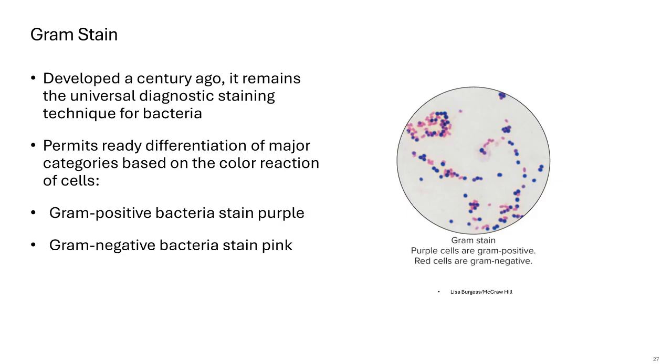If you're looking at an environmental sample that you've isolated, and it could be one of 100,000 different kinds of bacteria, right? To narrow down your search, a really common thing to do would be to determine, is it gram negative or gram positive? Because once you've done that, you've excluded the other half. So gram staining will do that.